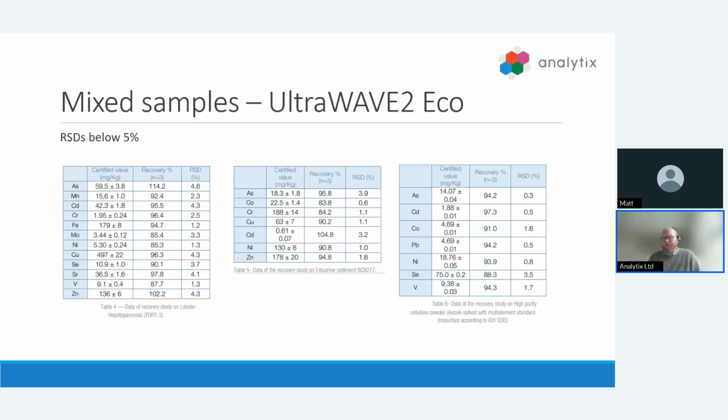Here we can see the analytical results shown on tables 4, 5, and 6, and they demonstrate good recoveries of all elements, and RSD values below 5%. This demonstrates the robustness and reproducibility of microwave digestion using single reaction chamber technology.